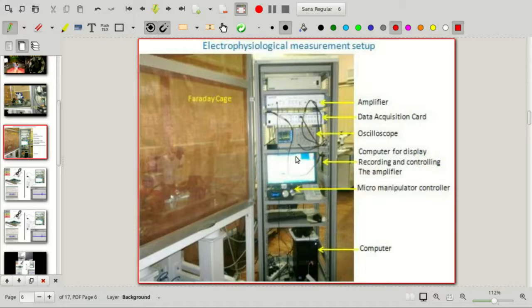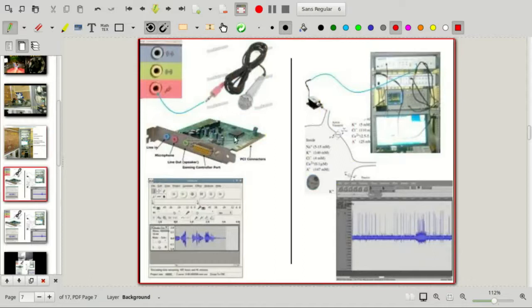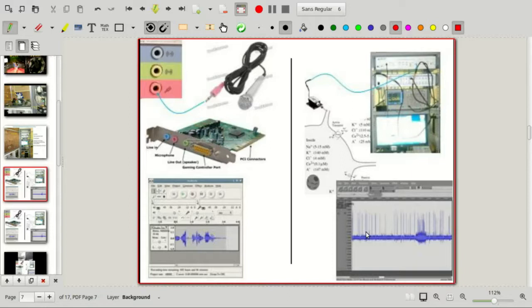Basically, this entire system does the job of a sound card — there are ports for a microphone, it gets amplified, digitized, and recorded. This system is very analogous to that: the signal is picked up from the electrode, amplified, digitized, and you can visualize and store it on the screen. Quite often you attach a speaker to this channel so you can monitor the sound happening — these signals are in the kilohertz range, which is the audible range, so as long as you sufficiently amplify and feed it to a speaker, you can listen to what is happening at the tip of the electrode.